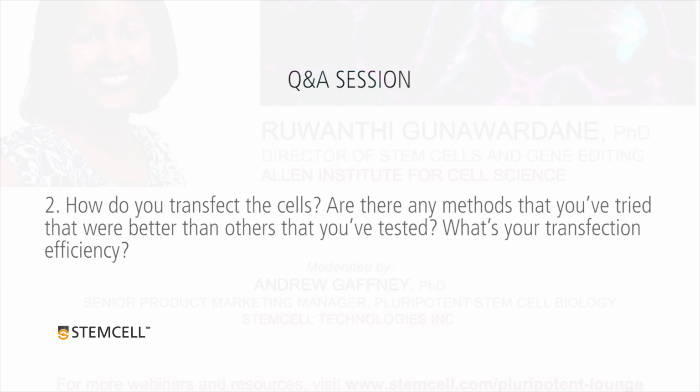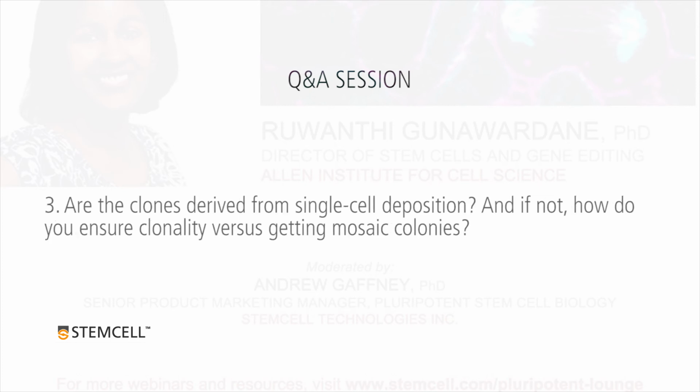Lipofectamine methods. We tried about 9 different transfection methods and found that in all those cases, either the DNA goes in well or the protein goes in well. But remember, we are putting in RNA, DNA, and protein. With the electroporation method, we can get up to 50% transfection. But there is some cell death associated, so that's not ideal. So we just do a lot of cells to end up getting enough cells to then do our enrichment with. So about 50% transfection.